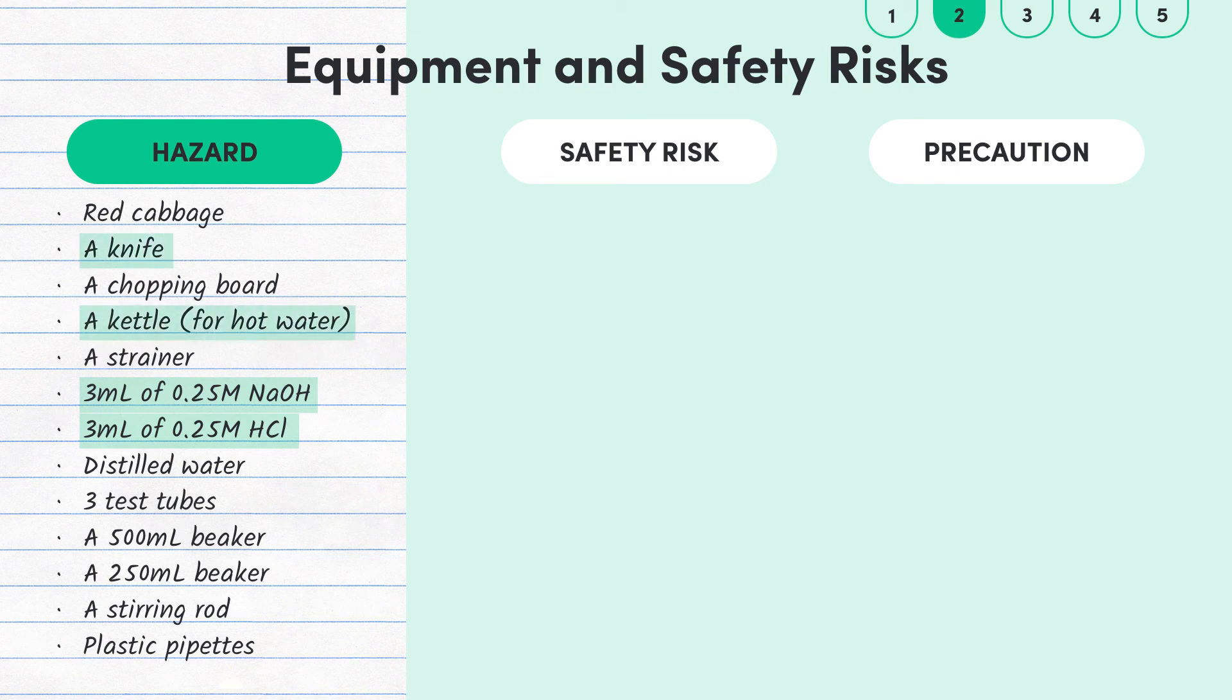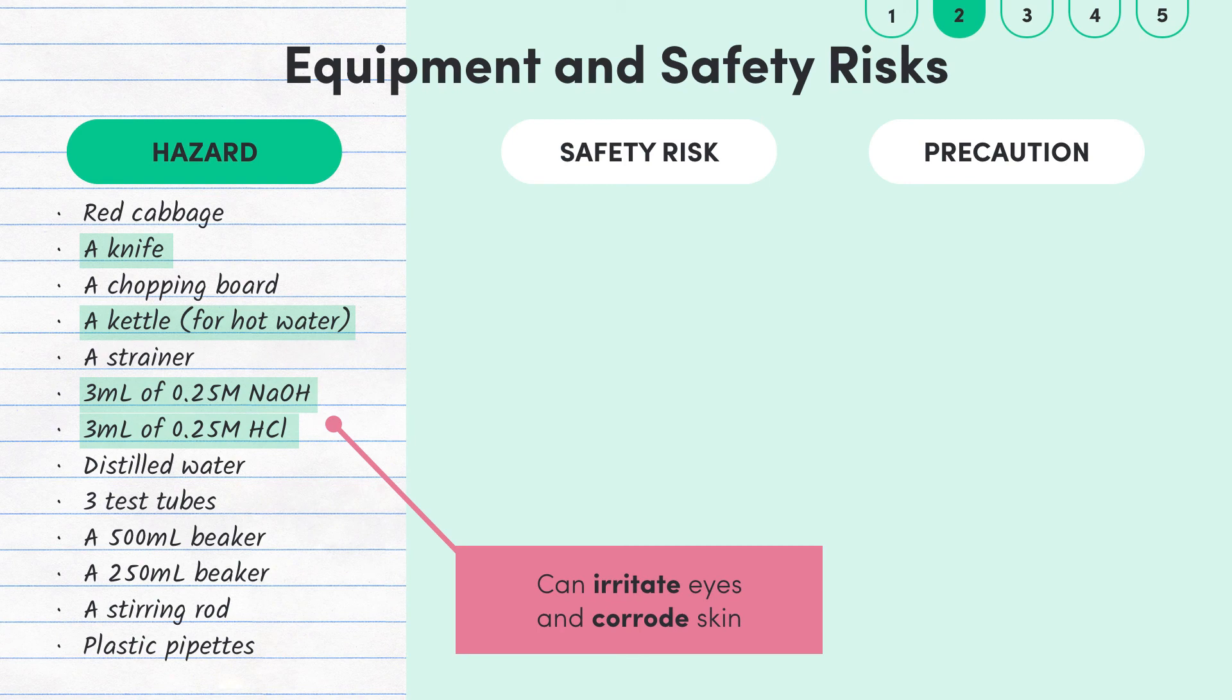The risk of using sodium hydroxide is that it can irritate eyes and can corrode your skin. The safety precaution we can take here is to wear safety glasses and a lab coat to protect our eyes and skin. Hydrochloric acid has pretty much the same risks and safety precautions in this experiment.